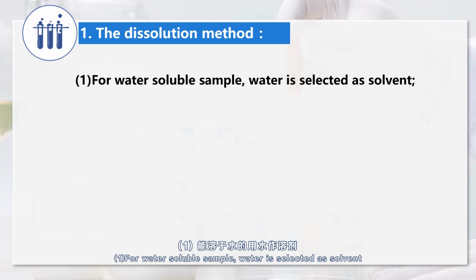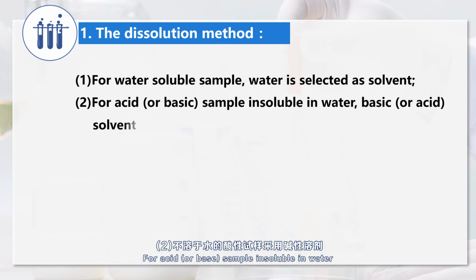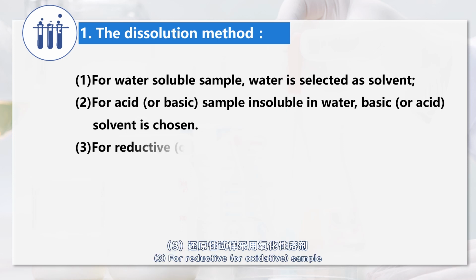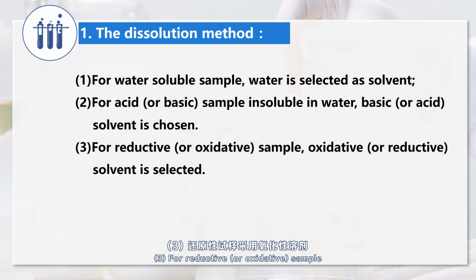First, for water-soluble sample, water is selected as solvent. Second, for acid or base sample insoluble in water, basic or acid solvent is chosen. Third, for reductive or oxidative sample, oxidative or reductive solvent is selected.